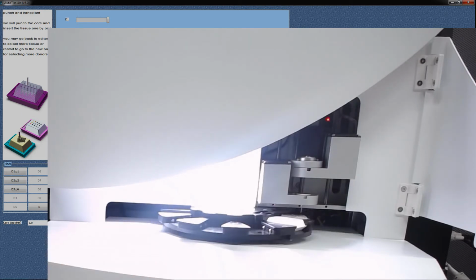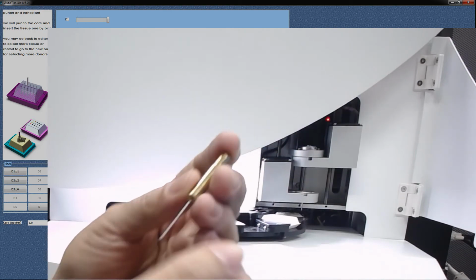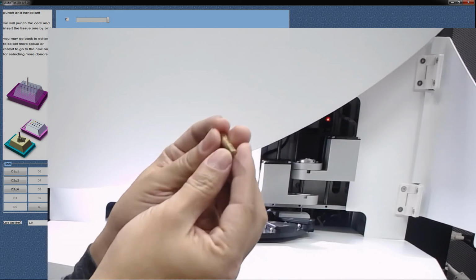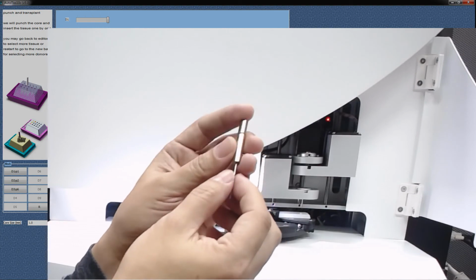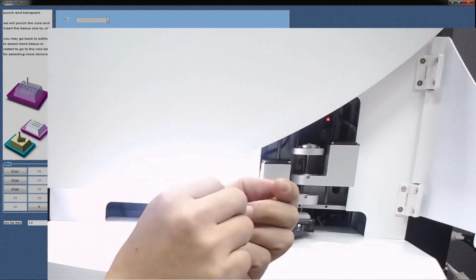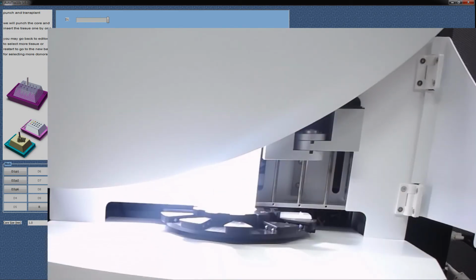The advantage of using our machine is this technology of coaxial punchers. It will take the upper two for drilling the recipient block, and then the bottom two for taking the tissues. By doing so, we can make sure that they all align to the same positions. Unlike others that use two sets of punchers, and the disadvantage of using two punchers is that it has a misalignment issue. Okay, we just finished the processing.